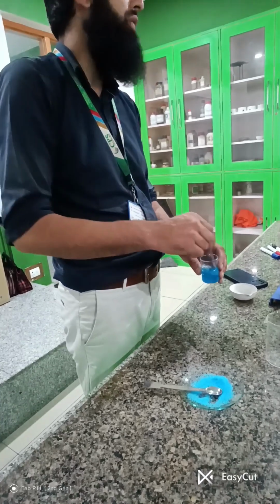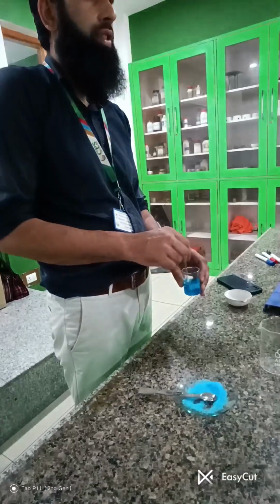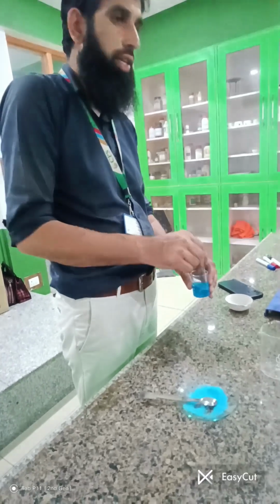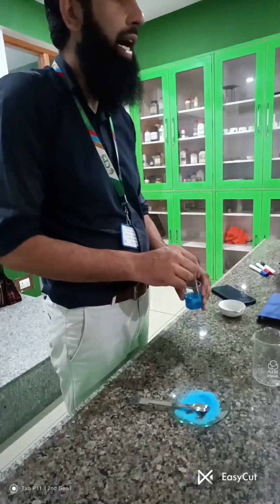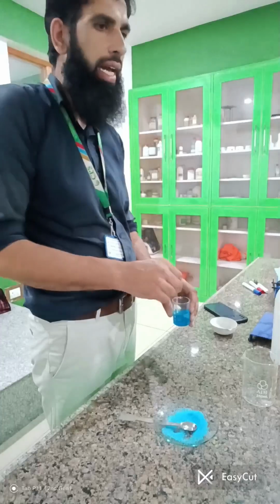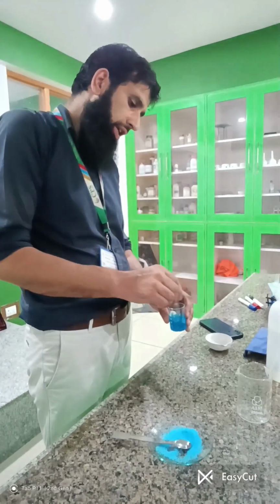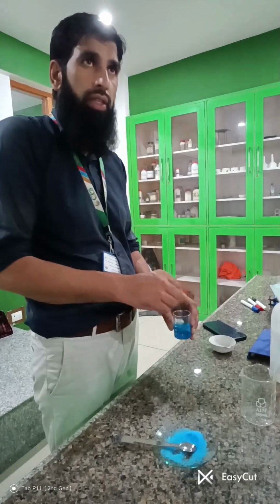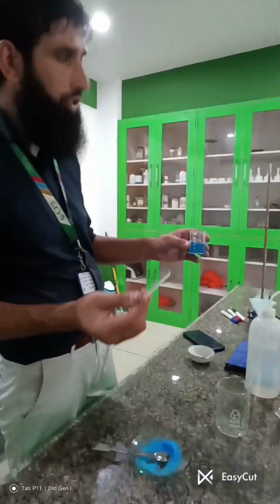It is almost a 2-hour experiment, but half of the part I have done, and I will show you in the video, because it needs heating and requires just 1 hour. And for crystallization, that is in front of you. I did an experiment in the morning so that I will keep it as homework and you will only see what is going on. In this experiment, I will show you only a demonstration of what we do. Now the solution has been formed.